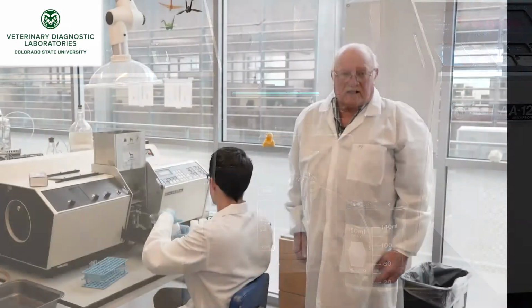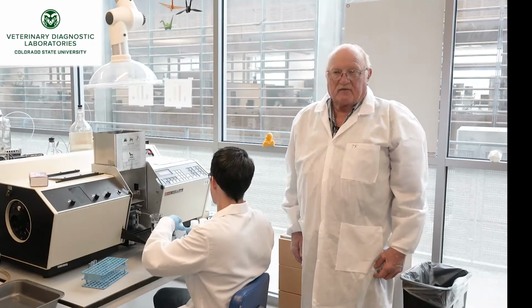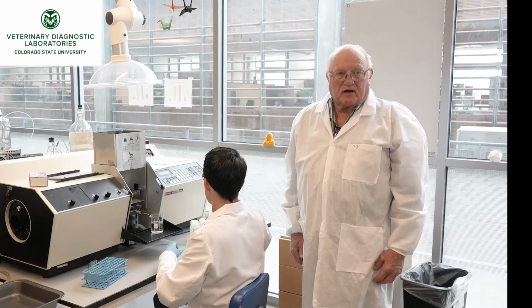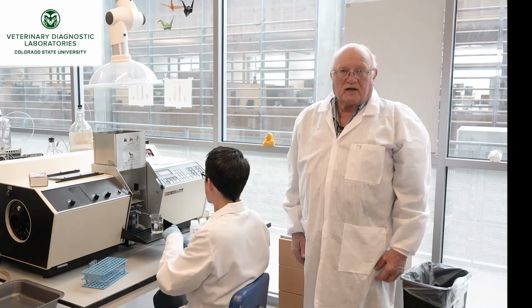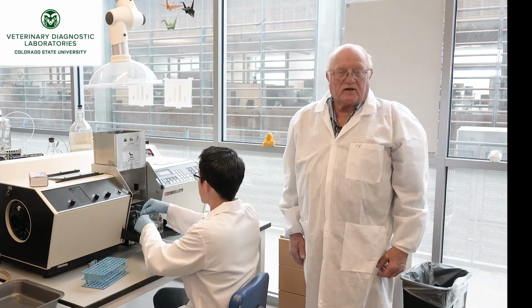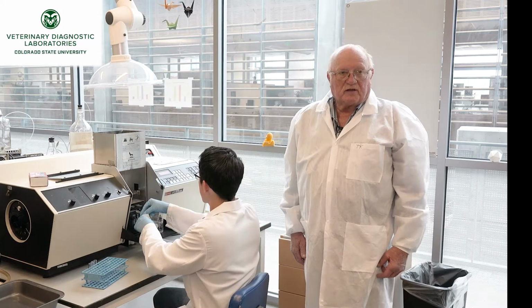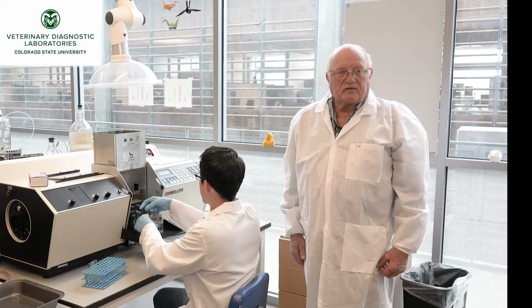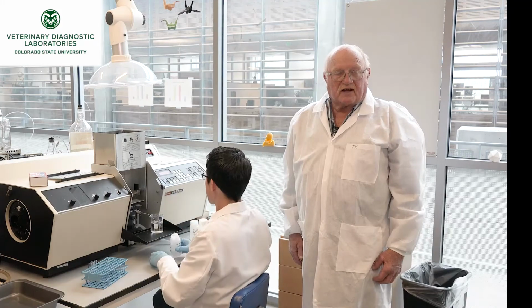and that change in light absorbency is a function then of the concentration of the metal. We do standards, and they have a particular absorption, so then we plot the standard concentration against absorbency, and over a certain concentration range, that's a linear expression, and that's all put in Excel and a standard curve made, and then the samples are compared to that standard curve.